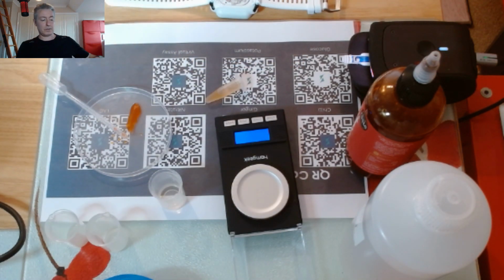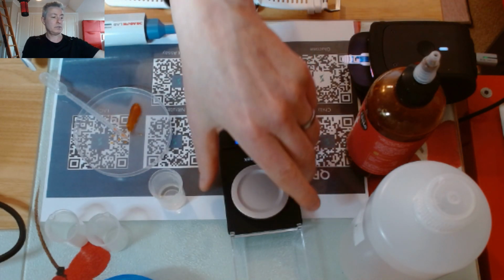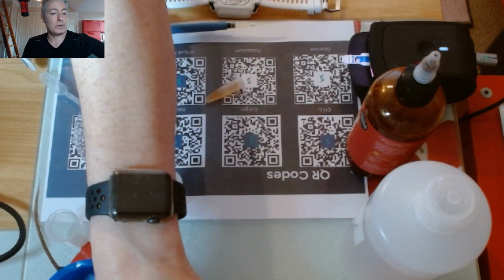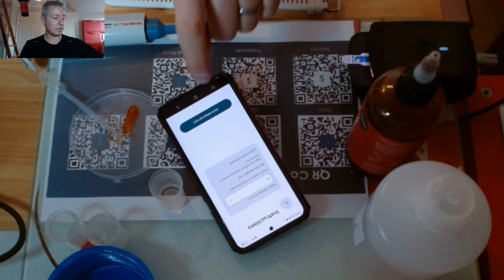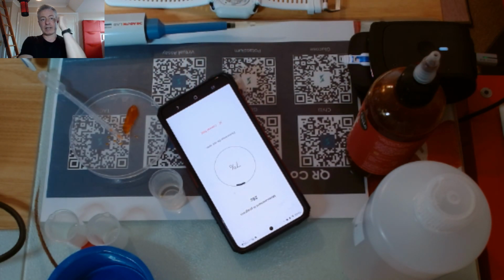Right. Okay, done. That's the other nice thing about the kind of science that we do at ZP. I have a Bluetooth connection between my phone and the device. I'm going to hit go to assay. So now I'm just going to move that out of the way. The app is asking me what kind of dilution I used, and I only used a 1 in 10 dilution, so that's completely fine. And I'll just start the measurement. The other thing I quite like about this analytical science that we do is that it is also, lastly, quite rapid.